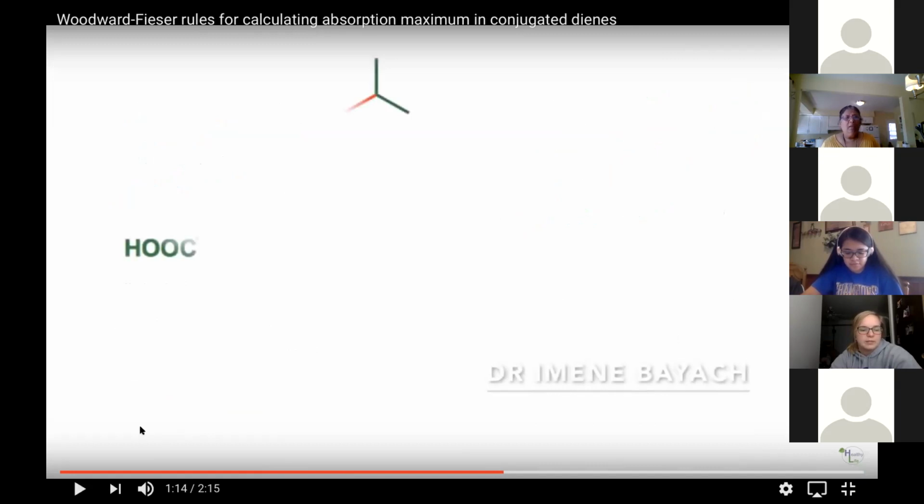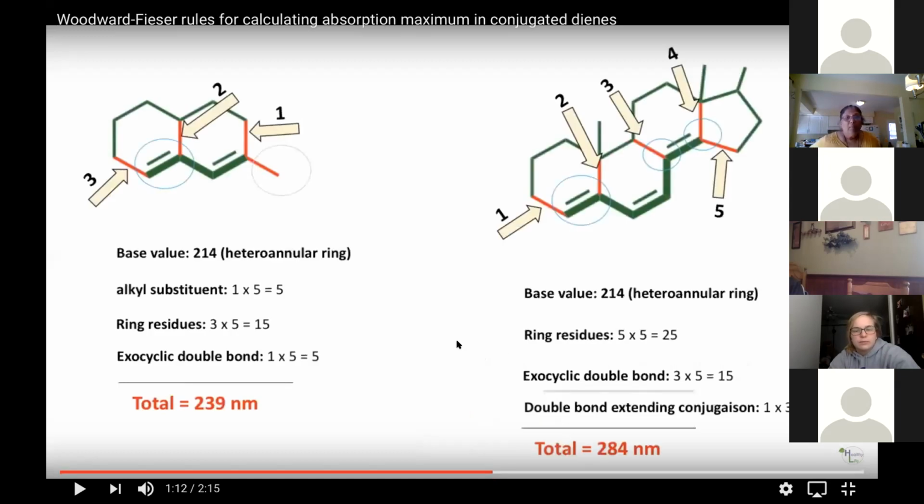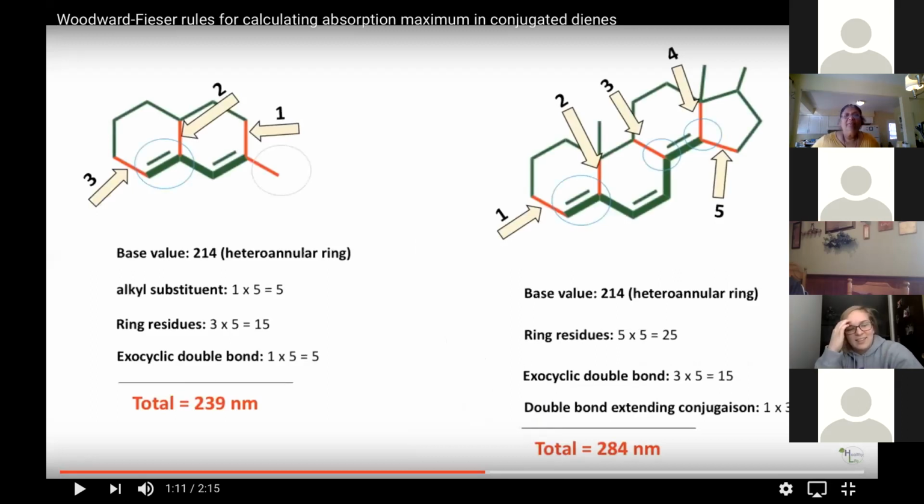Oh no, it went too far. You went too far, and KJ has a question. Okay, so basically we're going to be looking at anything that's allylic to the pi bonds. Yes, anything that's directly connected to that system. Can you go back to that? Yes. You can explain, right?